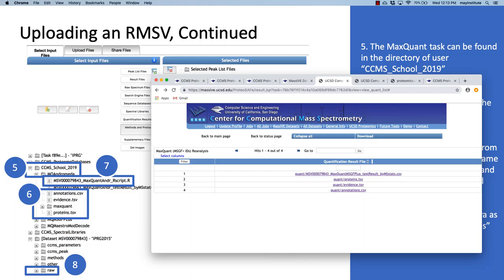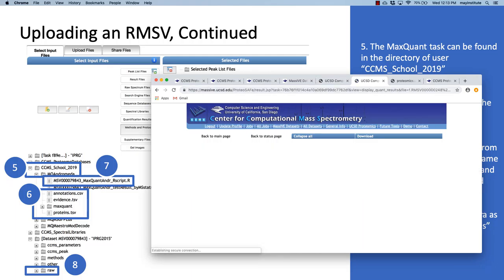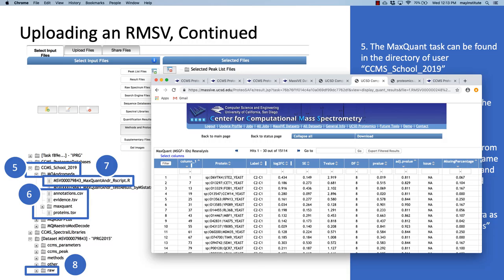On that results view, select for the significant results. How would we do that? How do you determine which MS stats results are significant? That's right. So you can just go to this column over here. And how do you want to filter it by? Adjusted p-value, what values? So you can just adjust the upper limit, set it there to 0.05.